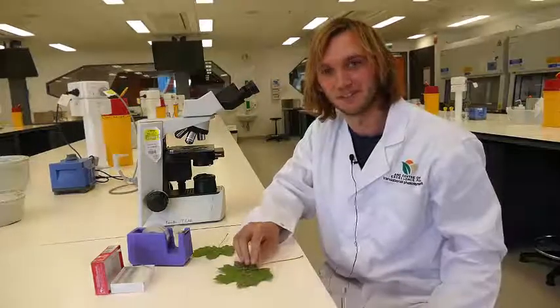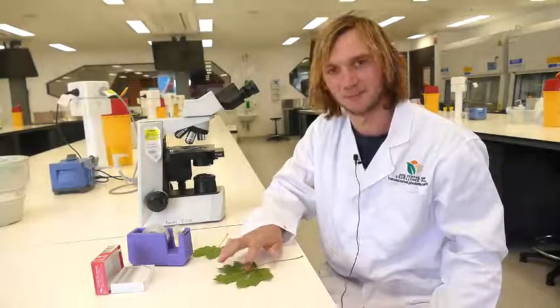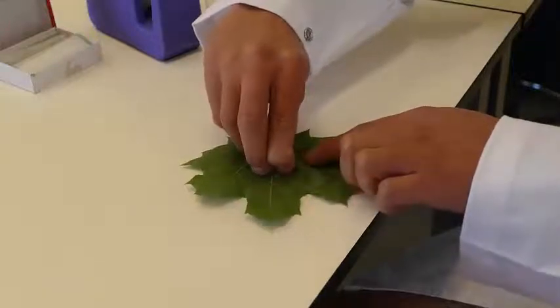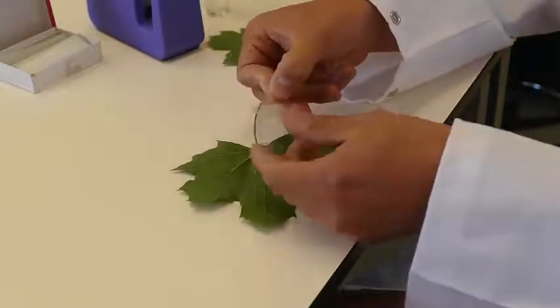Ideally, press down so that you don't get too many air bubbles underneath, because that makes it more difficult to see under the microscope. Then gently lift up the tape, taking the nail polish with it.